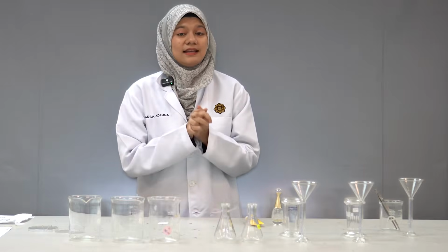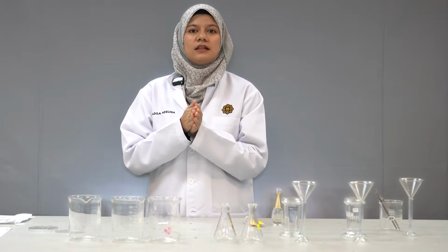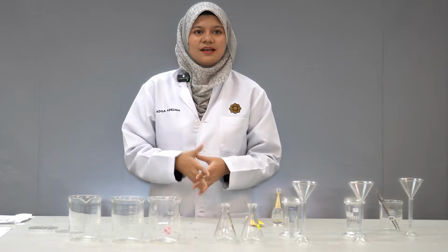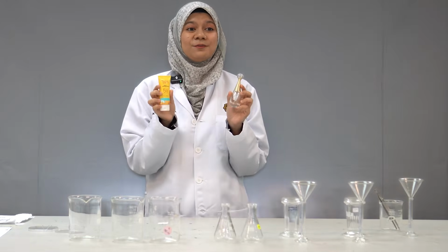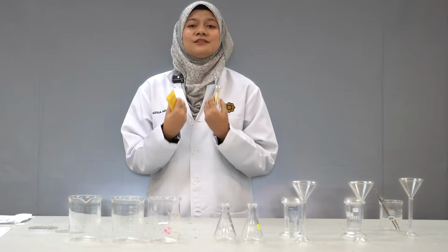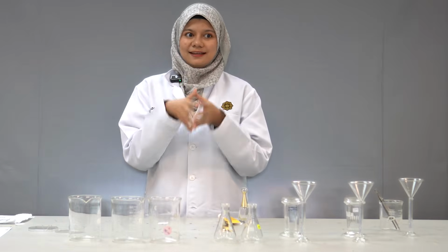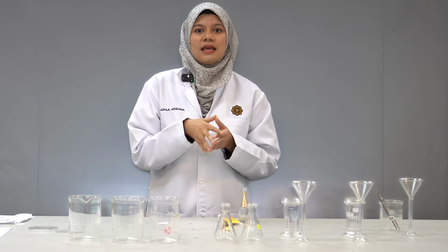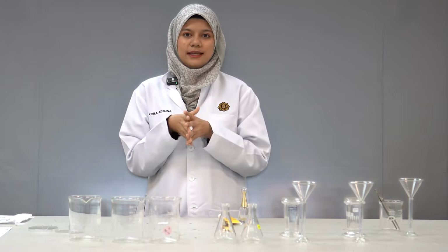To get a better understanding of the TLC method, I will explain a real-life example of the principle of TLC applied in today's industry. So, have you ever wondered whether this cosmetic and this perfume are actually safe for us to use, even though there are chemicals and alcohol inside them? This is how the TLC method comes in. It ensures the safety and quality of the products that we use nowadays.